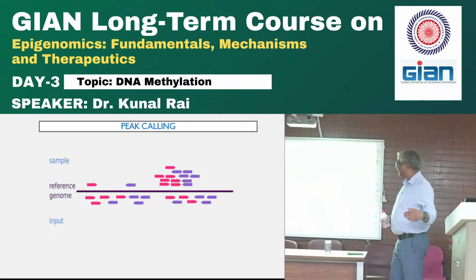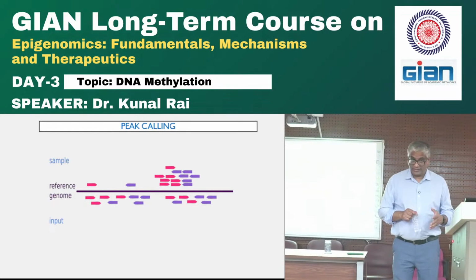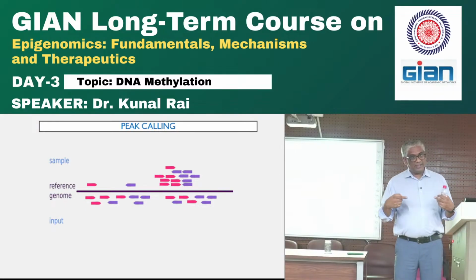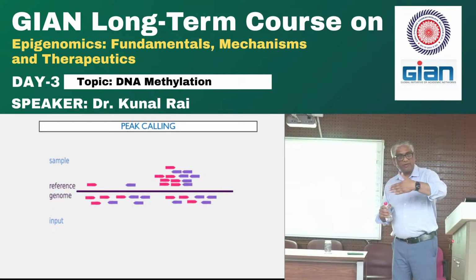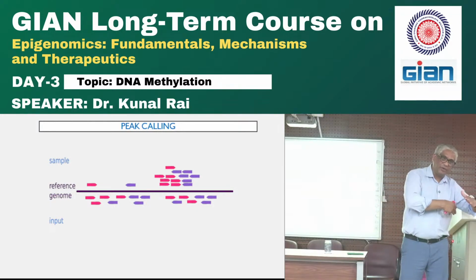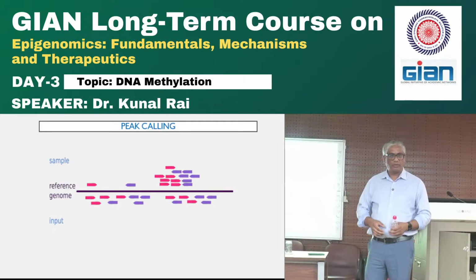Oh, that's just a read 5 prime to 3 prime. You sequence both here, this way and this way. I can get into details of that. You're randomly doing sonication, right? You're randomly aligning, putting the ligation, right? So we are going to read from 5 prime to 3 prime, right? So some will read from the forward end, some will read from the reverse end, forward versus reverse, and they will peak align at the same place, right? At the end of the day, sequence is same. Cool? No? Yes? Good?